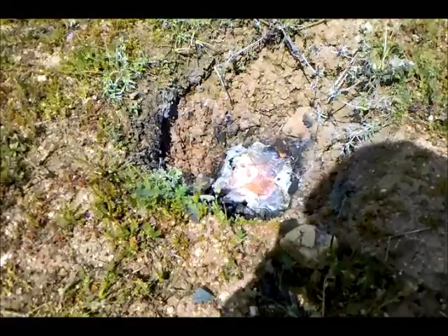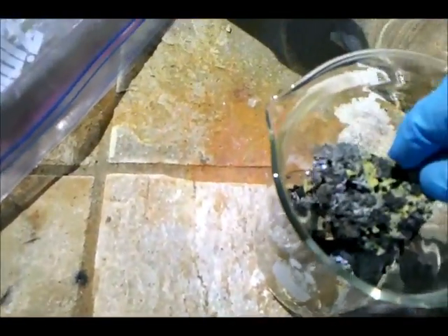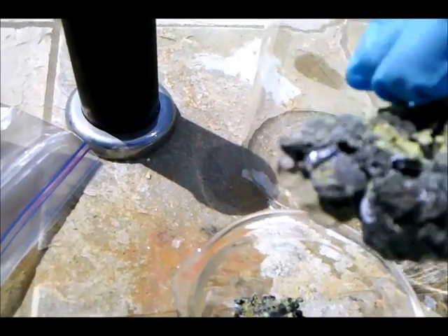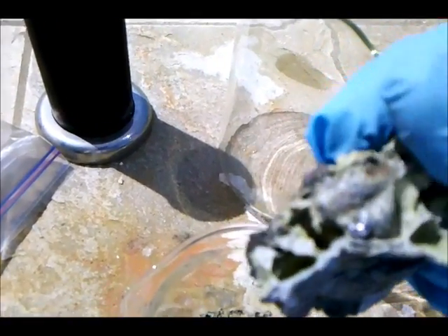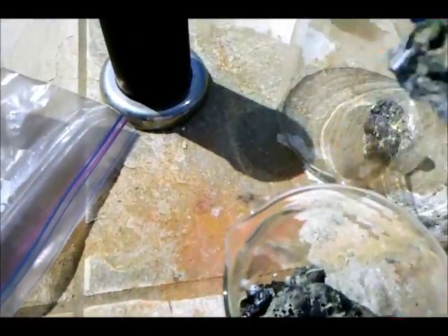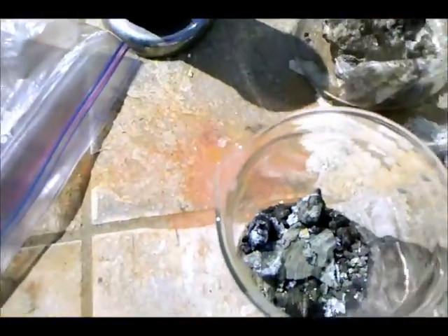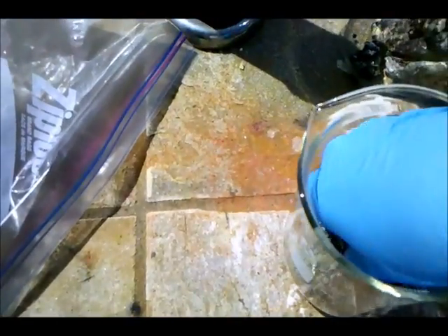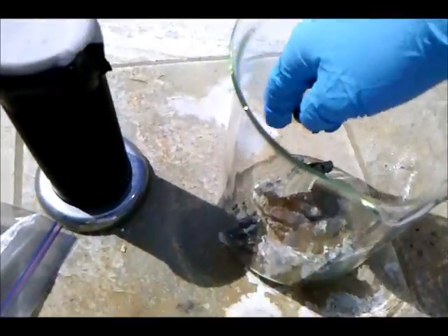I'm going to let this cool and then take this back to my lab. Back in my lab, I've got the products of my reaction that I crushed up into a few smaller pieces. I can see some stuff in there that looks like some unreacted aluminum, and maybe some silicon — it looks pretty crystalline. I'm going to add this to a larger beaker and first react it with some water, which might react with any aluminum sulfide that's been produced. Then if no reaction is observed, I'll add some hydrochloric acid to dissolve away basically everything but the silicon.